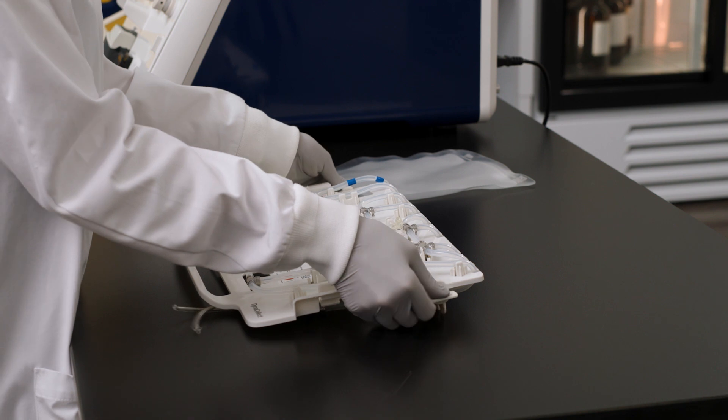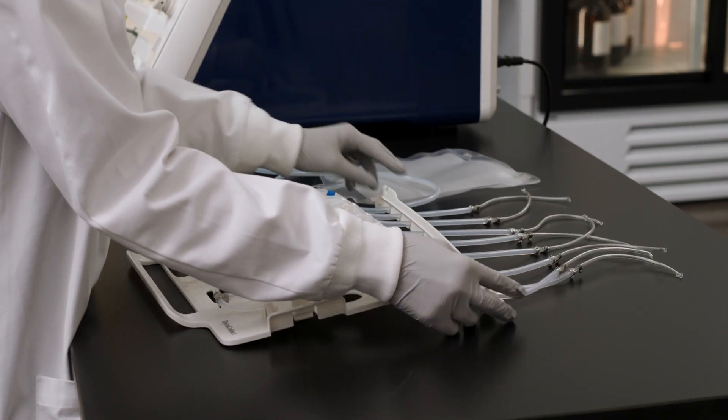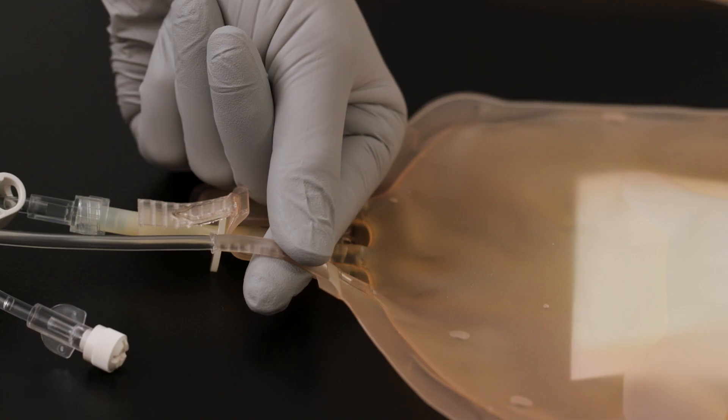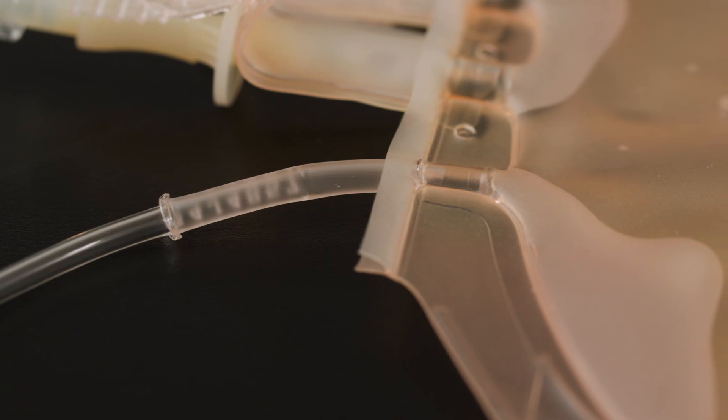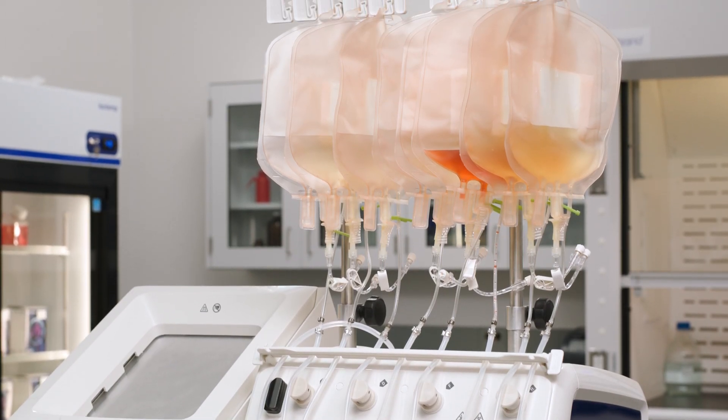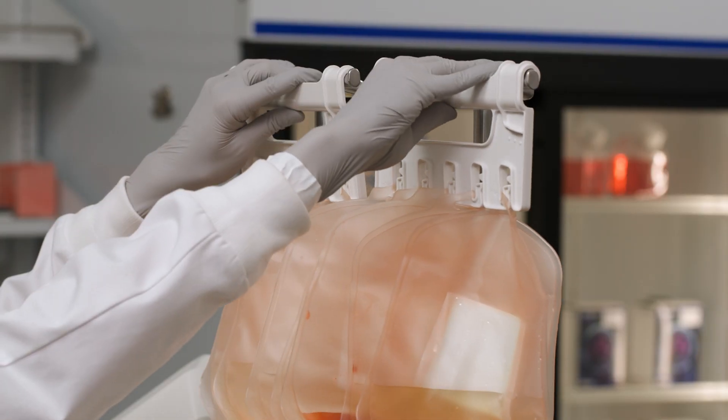Start by removing the tube holder from the catch on the back of the single-use cassette. Then, remove all the tubes from the catch on top of the cassette. Next, sterile weld compatible bags to the 8 weldable DEHP-free PVC tubes. Place bags on the bag hanger, then install them on the DynaSelect.